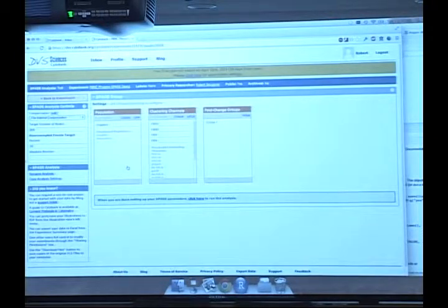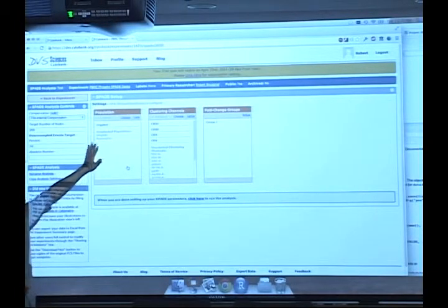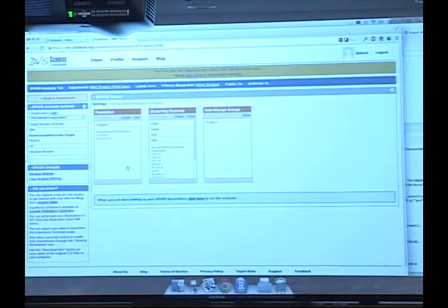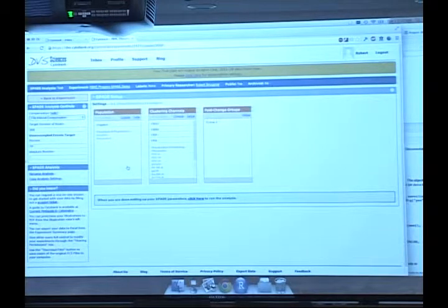And the thing that I'm not going to do here is, I've already actually gated these data out for singlet gating, so you can run SPADE on a subset of your data that you've already gated. Let's say you're only interested in looking at T cells with SPADE. So you can run SPADE just on a particular population that you've already gated. I'm just going to go ahead and run it on everything.